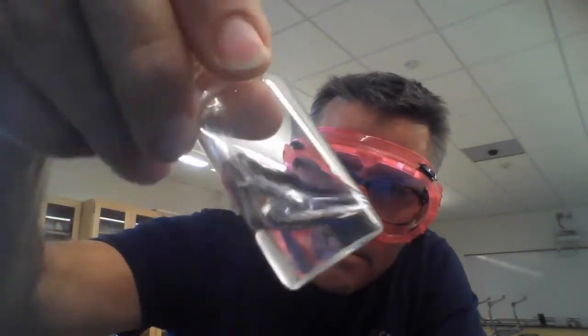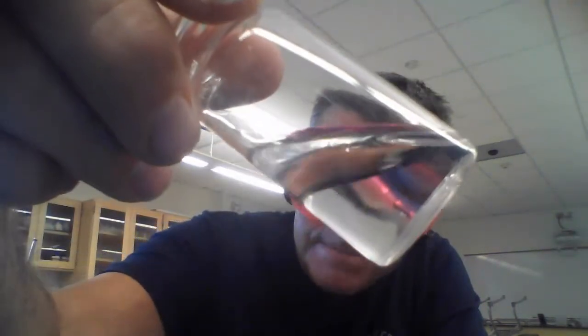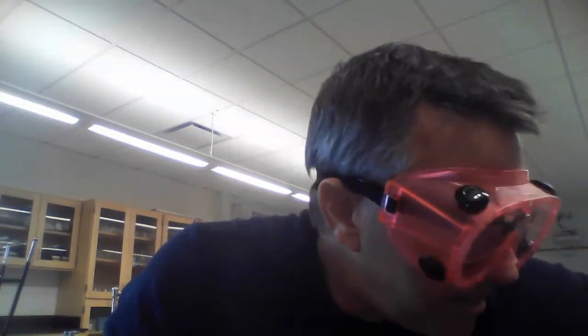Ethanol with an E. Some people say it looks like it has legs. It looks like it's a little bit greasier, like it sticks to the side. I don't really see it. Oh, there's an odor there. I like the word sweet to describe this odor. It's not like it smells like a sweet sugary thing, but it has a not unpleasant sweet odor.